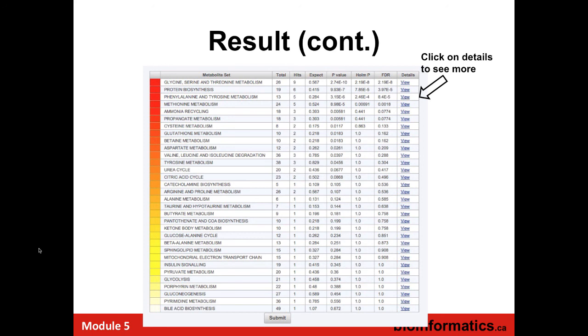You're just trying to reduce the frequency of false discoveries. So if you can live with a 5% rate of false discovery or a 25% rate of false discovery, that's fine.